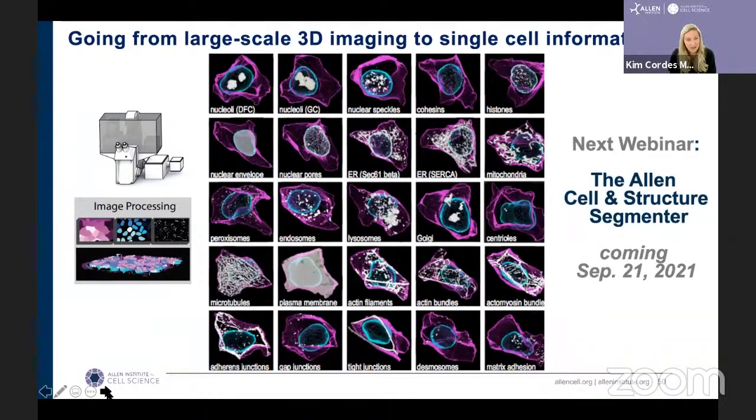And just think about the potential of this information, along with your single cell genomic information and other single cell information that is becoming widespread, and how powerful this can be. As I always hear, a picture is worth 1,000 words, and these cell lines do produce beautiful images.